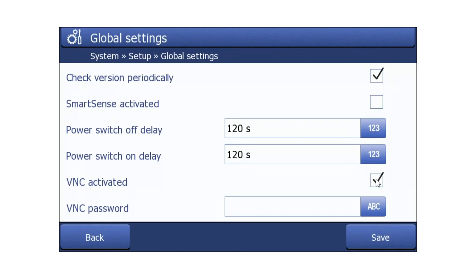Next, set a VNC password — for example, the name of the module, which in this case is DSC3.